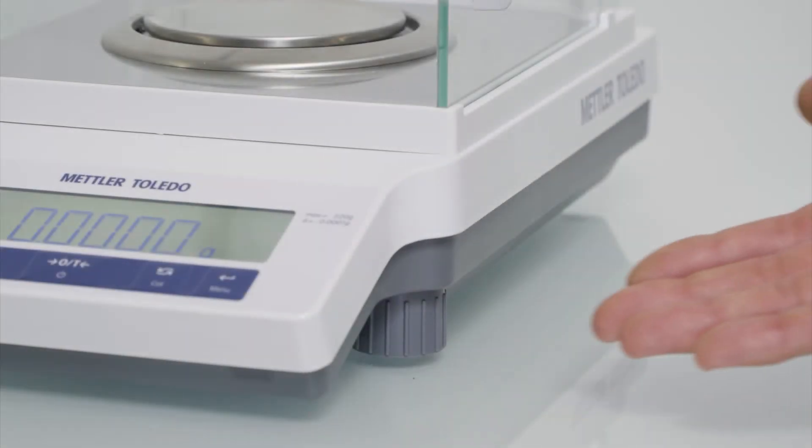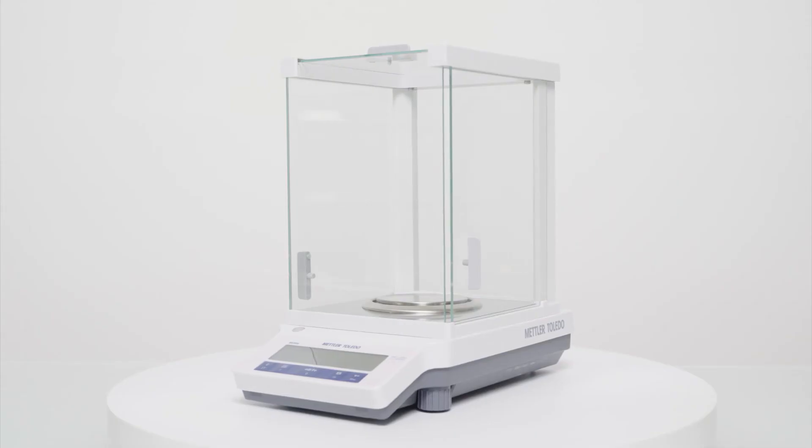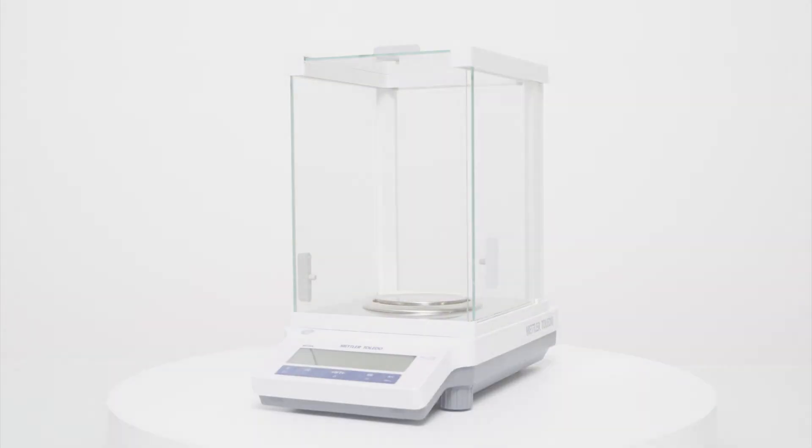ME balances are designed to make cleaning easy and keep them in good shape for years to come. They have smooth and flat surfaces such as a stainless steel platform and weighing pan. They are made from durable and chemical resistant materials and are easy to disassemble.